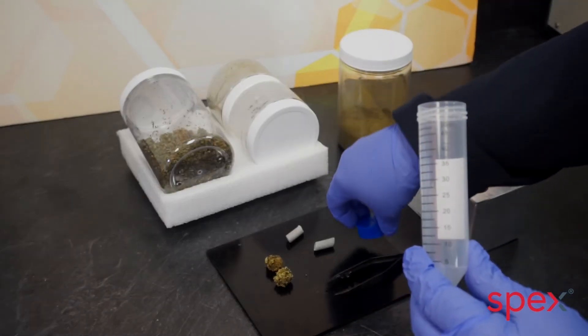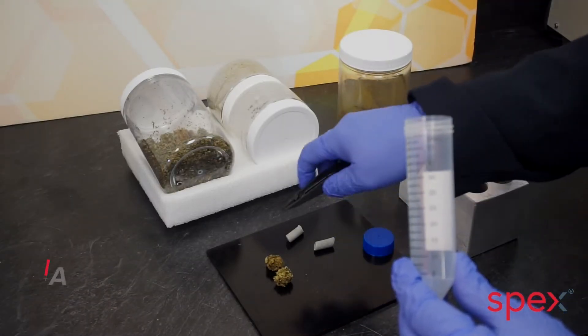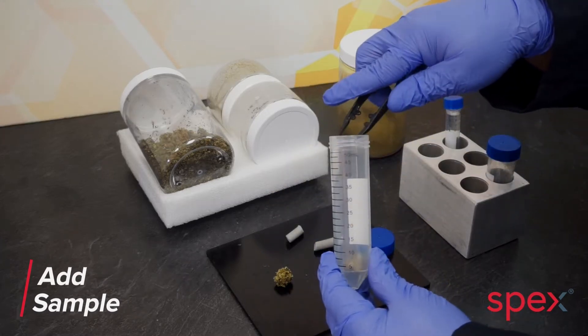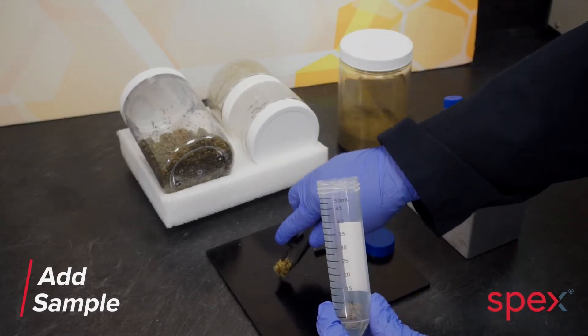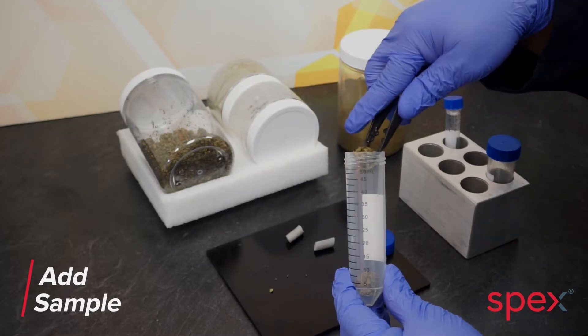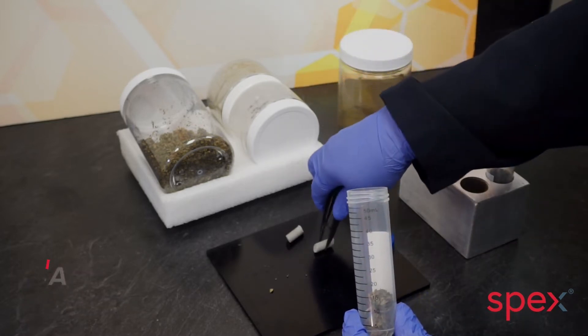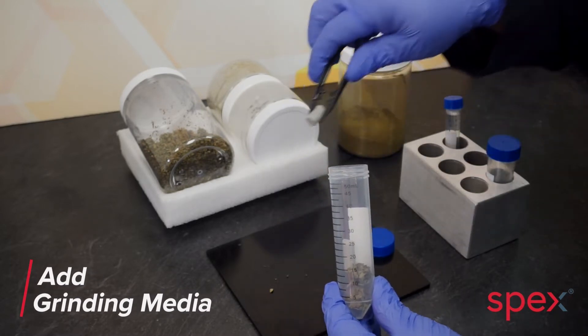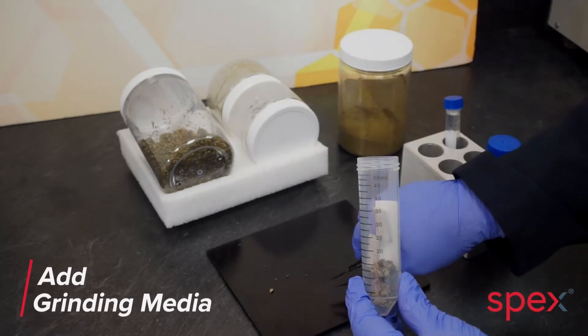For applications extracting pesticide residues, one to three grams of cannabis flour is added to a 50 milliliter centrifuge tube with two ceramic cylinders, 15 milliliters of acetonitrile, and a magnesium sulfate mixture to remove any water content.